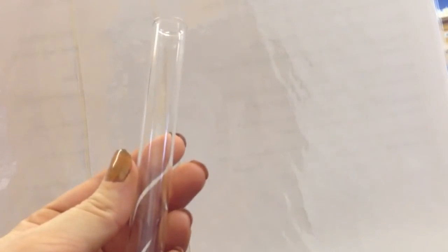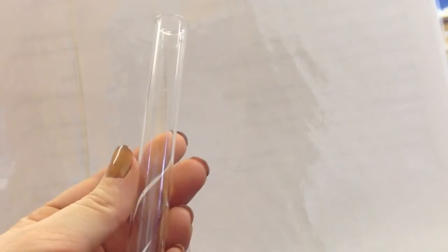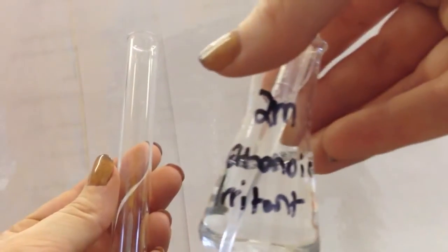So I'm going to make a rainbow in a test tube. I need some sodium carbonate, I need some water, I need some universal indicator, some 4% ethanic acid, and I need some 2 molar ethanic acid.